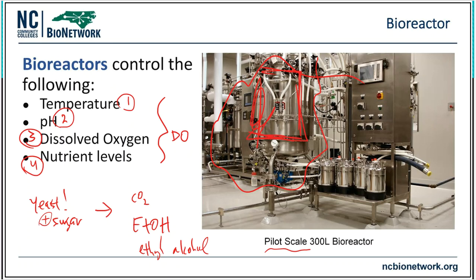But this is a bioreactor. I mean, that's kind of what's going on. Think of it that way at least, right? We are allowing a living organism, yeast, to make a product. So inputs and outputs and the processes that go along in the meantime in order to get to that final product that we are after.